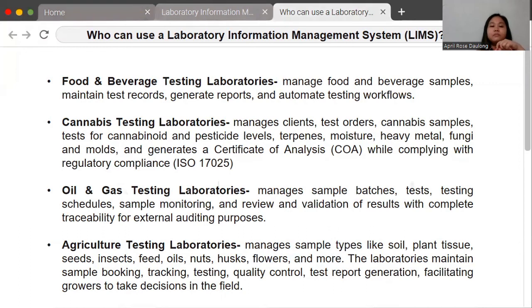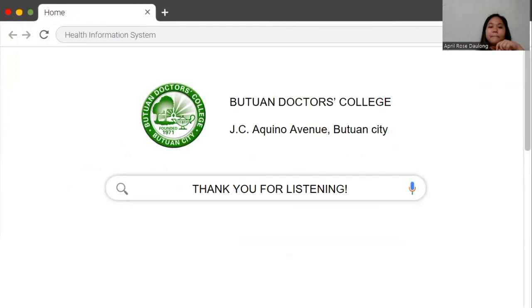So, to sum it up, ang LIMS, it has many advantages as you can remember sa akong mga ibang the main ways, accuracy, efficient, and management. Diba? So, gamit kaayong LIMS sa mga laboratories. Ay, maka-produce mga accurate, efficient, dili maka-less sa mga errors, hassle-free, it can manage data, informations.